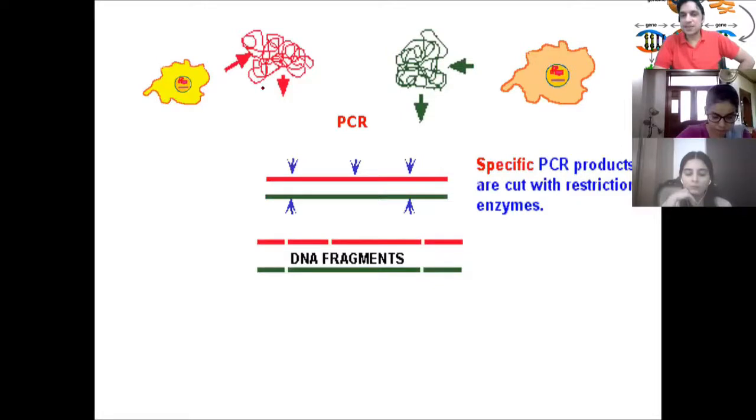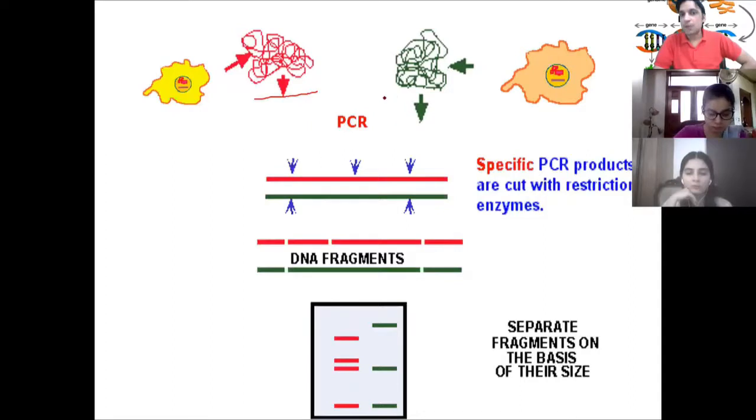So a cancer cell is cancerous because the sequence of the DNA is changed, and you can confirm it by different means. This is the most primitive, earlier, easier way to detect the difference between the two genes. So you amplify the sequence of a gene from the cancer cell, and you amplify the sequence of the same gene from the normal cell. This is the amplified product from the cancer cell. This is the amplified product from the normal cell.